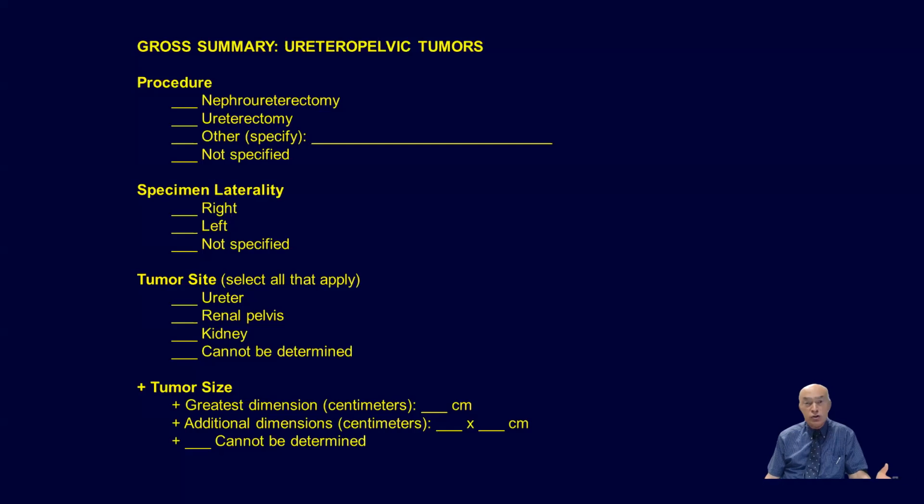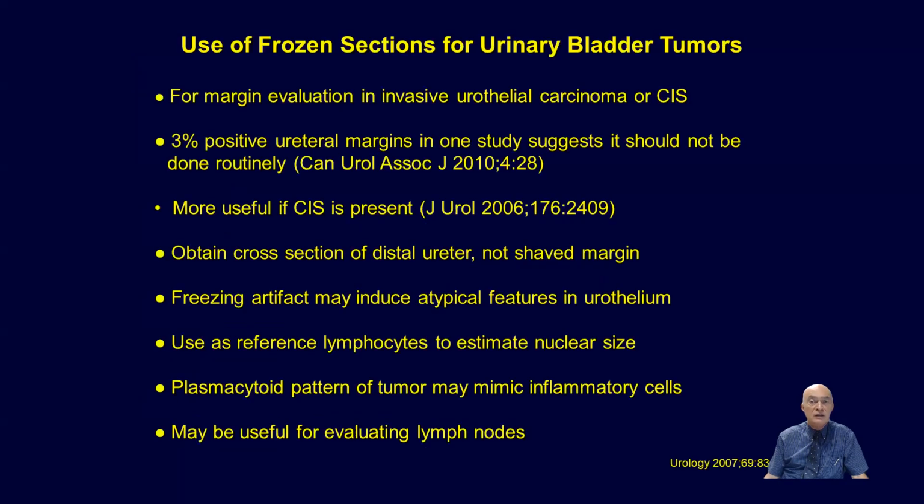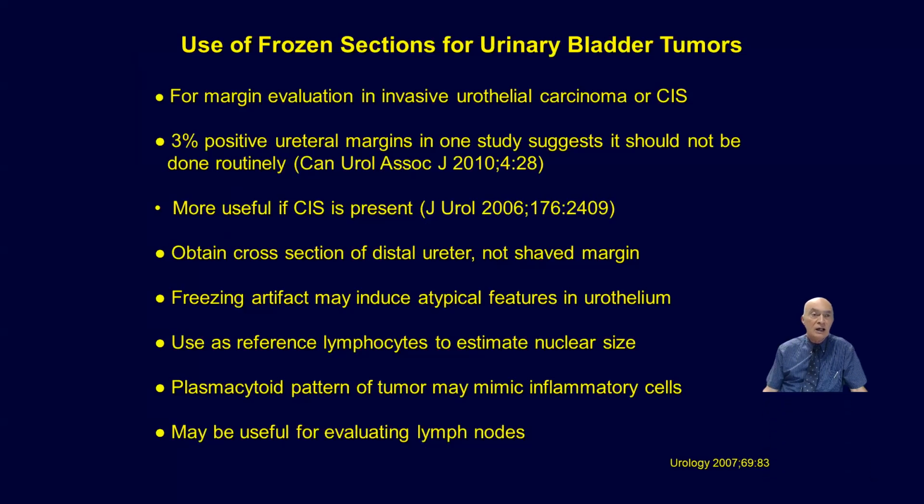Again, in the uretero-pelvic tumors, we also have to have the same kind of protocol to describe the gross examination with different aspects of the location and the measurements. And then we pass to examine the urinary bladder as a different specimen, the genitourinary tract.